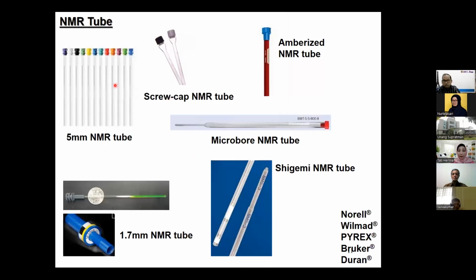Okay, this is the NMR tube that we use, a 5 mm screw cap NMR tube. Usually anybody who is doing catalysis, or what I have experienced is gold catalysis, wants to observe what happens to the compound during the reactions. So we put our reactant, reagent and gold catalyst. The loading is easy for us to open from the top, loading several percent or millimoles of catalyst and directly run the NMR, and we can observe it.